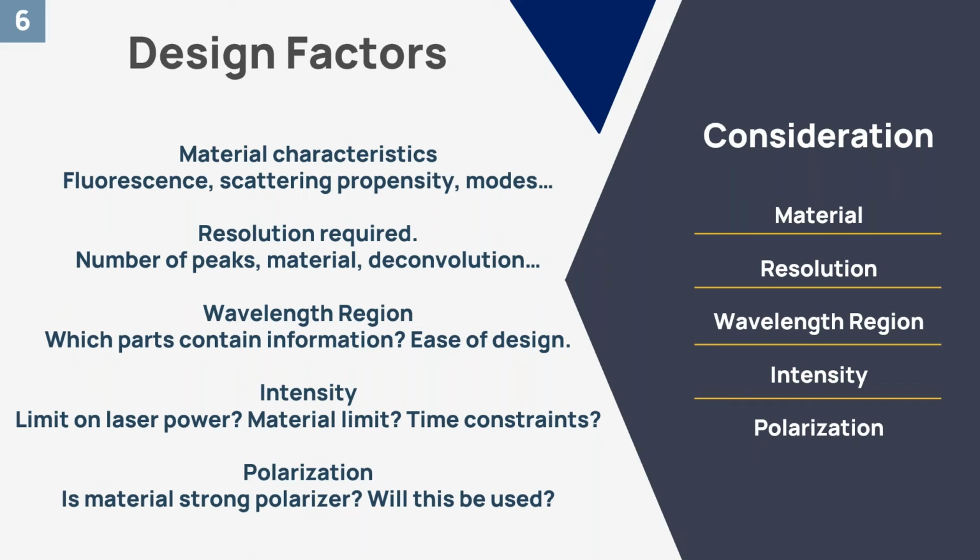So there can be a little bit of give and take there in what would be practical, what are you interested in as a use of such a system, and what's easy for a manufacturer to design for you. Does it have a downside that you have basically a broader bandwidth than you need, or can you live with that from a cost perspective or a practicalities perspective?